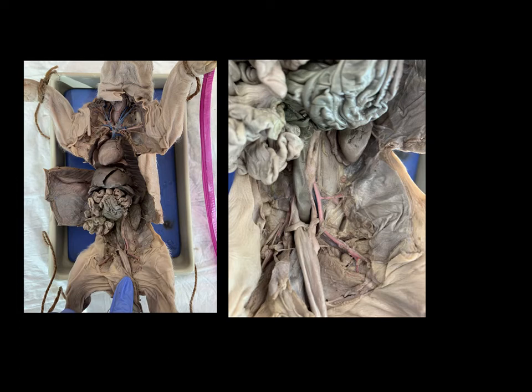Moving down further still, now we're looking at this region of the pig in our image over here on the right. To orient you, here's the bottom portion of the kidney. Here is that abdominal aorta, and the abdominal aorta has some vessels that break off of it at this point and go down towards the leg.